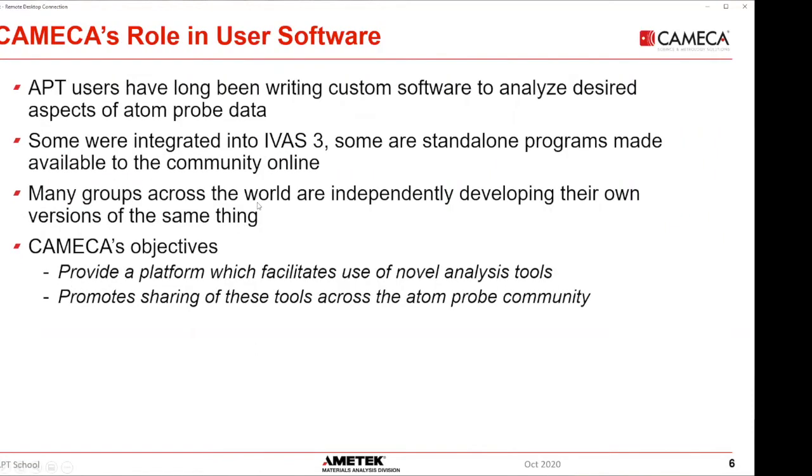So this is my philosophy, and hopefully CAMECA will embrace it as well. This is my philosophy and how we deal with the user-created software, the stuff that Peter and Marcus and all of you have been showing. For years, users have been writing their own software to do very specific atom probe data analysis. We've tried over the years to integrate some of those things into IVAS, but a lot of these things were very, very specialized. Maybe they had a lot of parameters, and it really didn't work very well.